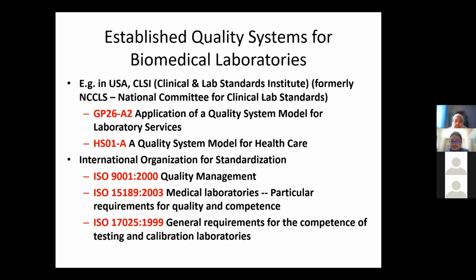Yang saya tunjuk ni just history lah, mana-mana yang terawal, but you will find a new one. Always there are the new one. Okay. ISO 17025 1999 on the general requirements for the competence of testing and calibration laboratories. So there are labs that do testing and calibrate, and they need to be certified juga.